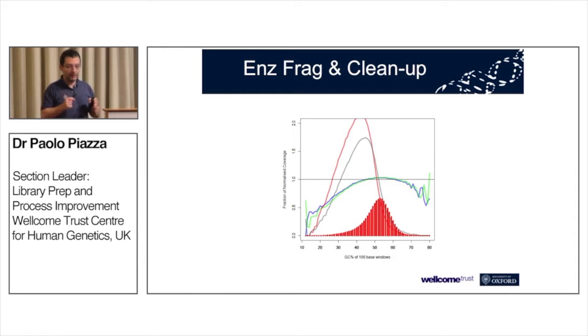So we are thinking hard of ways that we can bypass this problem, and I'm not sure that there is an easy solution. Probably we can just resign to the idea of using a sonicator outside of the Echo and just go for the best results ever seen.